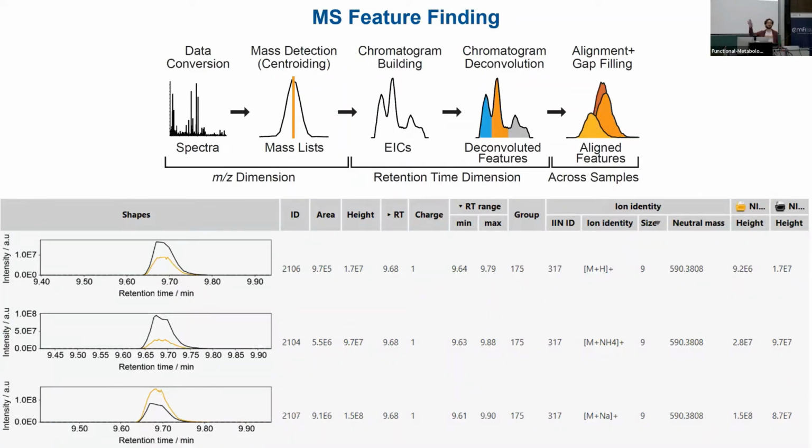We did all this processing yesterday and it was kind of confusing, but as I already said, there are faster ways to work with MZMine, especially if you know all the steps. You have the batch mode and you can directly run through everything in minutes. But in the end, we ended up with the aligned and gap-filled feature list, which is basically a feature matrix, right?